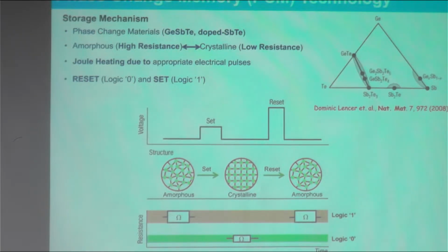There are multiple techniques available. PVD based techniques are already there, some thermal evaporator based techniques, sputtering units, and if you go to higher sides, ALD deposition is also there, and molecular beam epitaxy. Based on that, you can coat these chalcogenides. Based on the appropriate composition, you can deposit these thin films, and then accordingly you can characterize. For deposition of these films, based on the elements, you can identify the suitable composition, and then you can deposit.